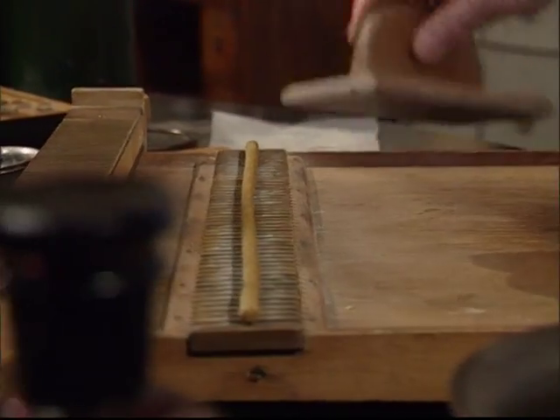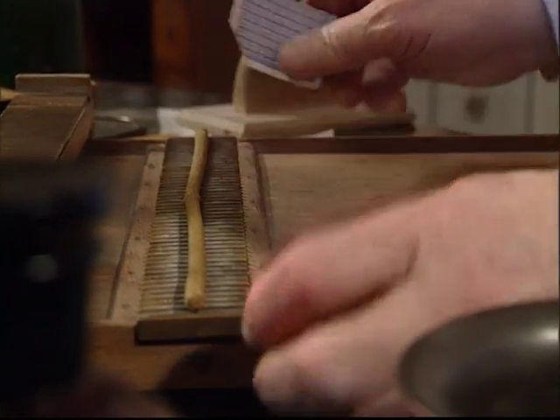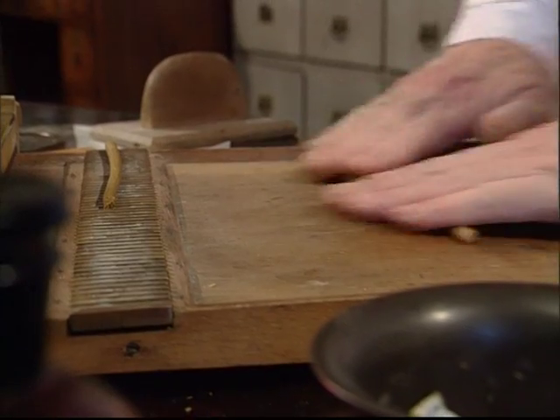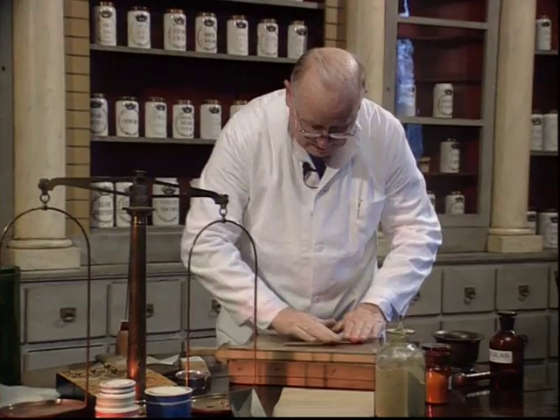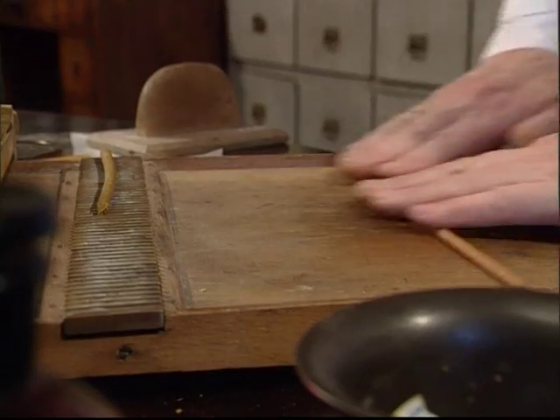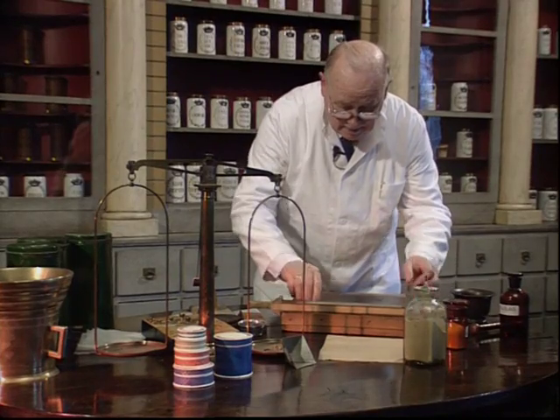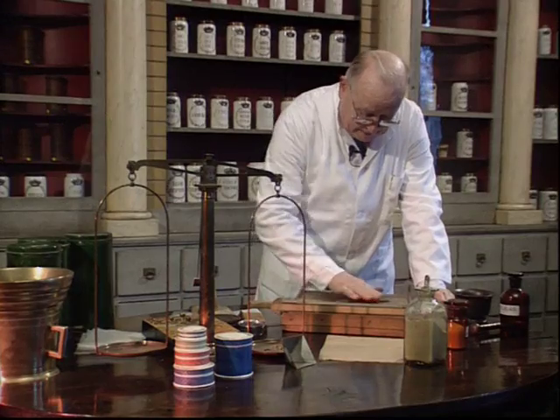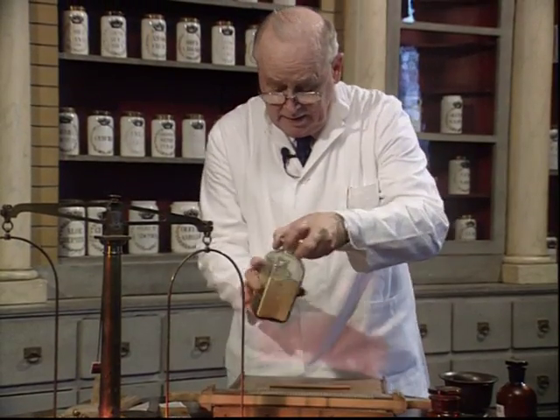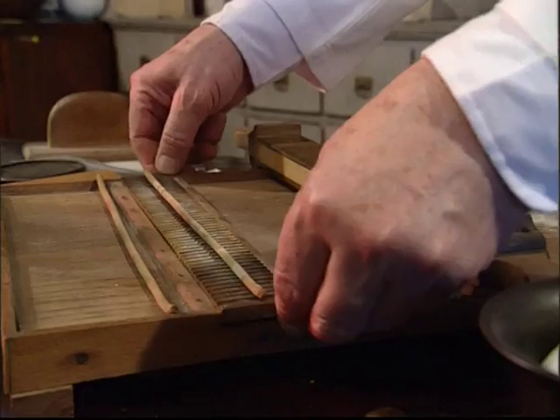So now we can divide it into two pieces. There. And now we need these two rolled out to the same length, so we'll have enough for 100 pills. We'll take the other one while it's still soft. I think we'd better have a bit of witch powder here, so they don't stick.